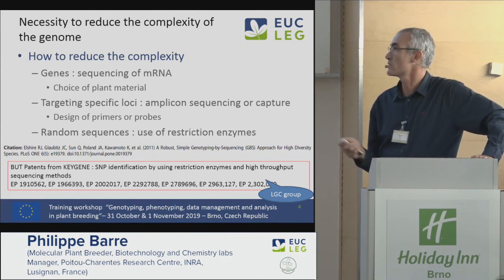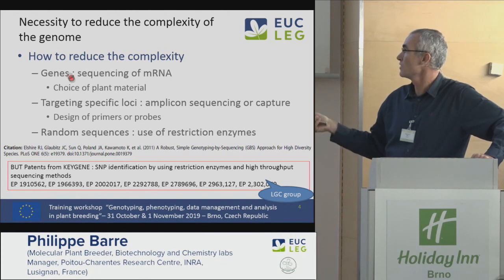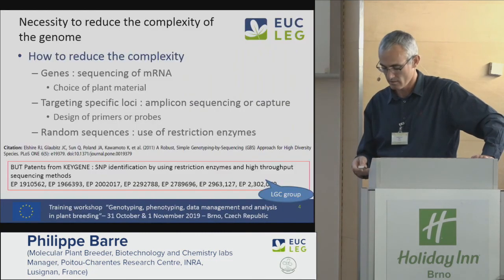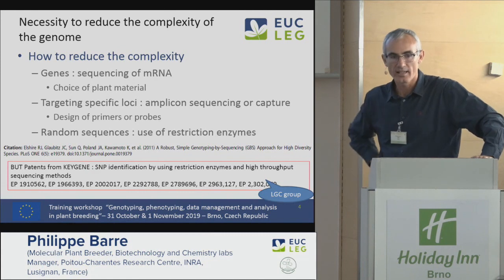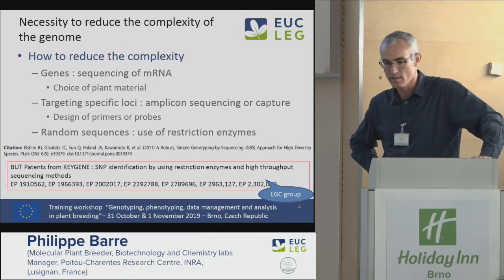But even though, there are patents, because you have several patents from Keygene, from the Netherlands, for the SNP identification by using restriction enzymes and high-throughput sequencing methods.